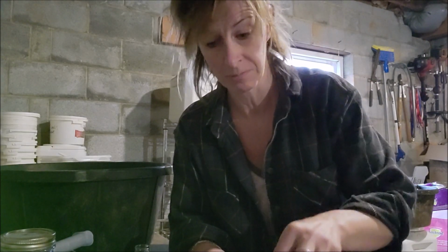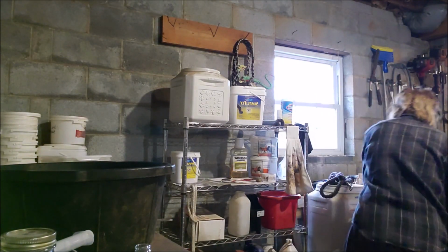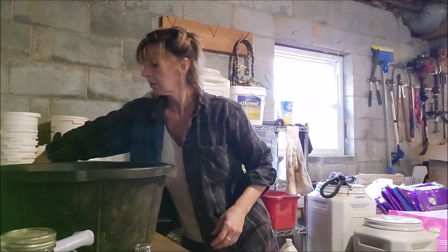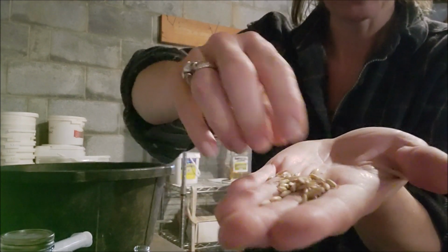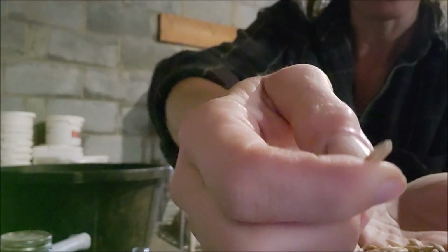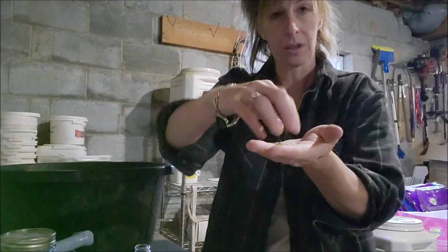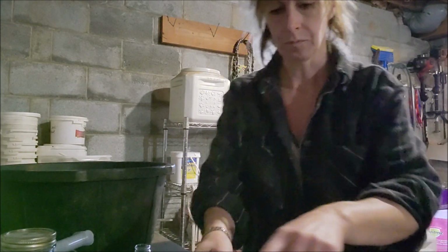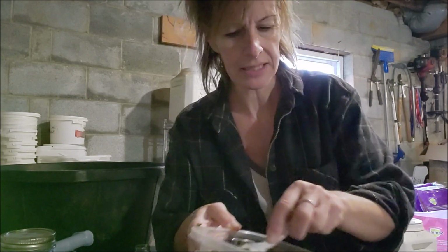If they eat oats, their systems can't break down oats. So what you'll see is a couple of the oat pieces. Now these are crimped oats. They've already got a piece that's kind of crimped in it, so their tummies can break it down a little bit easier. But if they can't, you'll see the oats in here. And I don't see any oats.